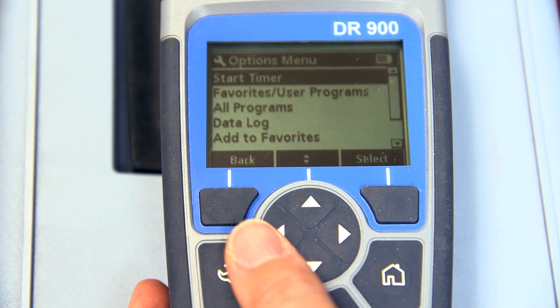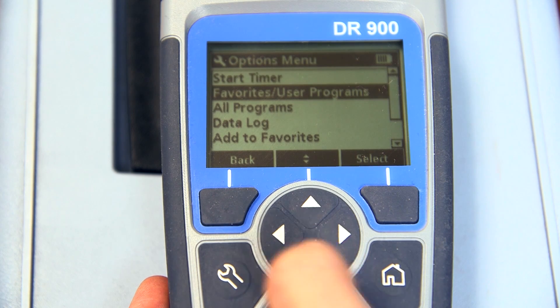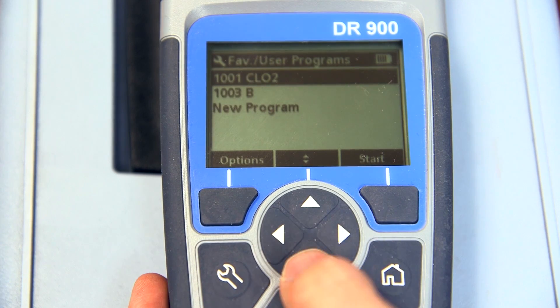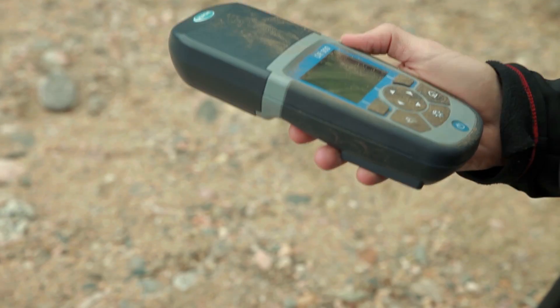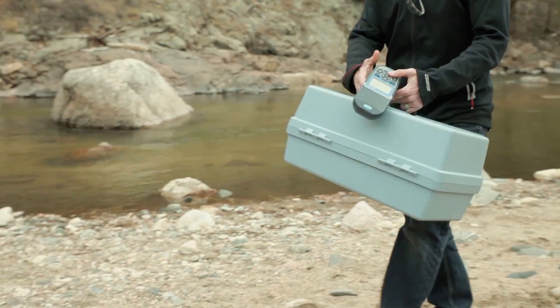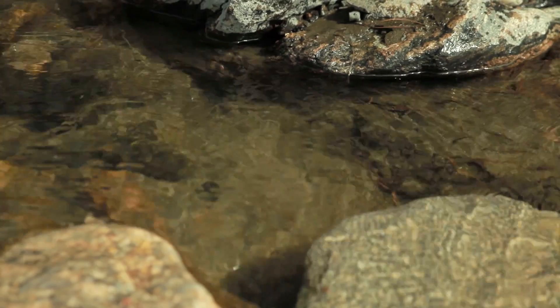Testing in the field should be done with confidence, not concern. Access your most used methods in less than four clicks. Have confidence that your instrument can handle rugged field conditions, and the occasional impact shouldn't prevent you from getting the data you need.